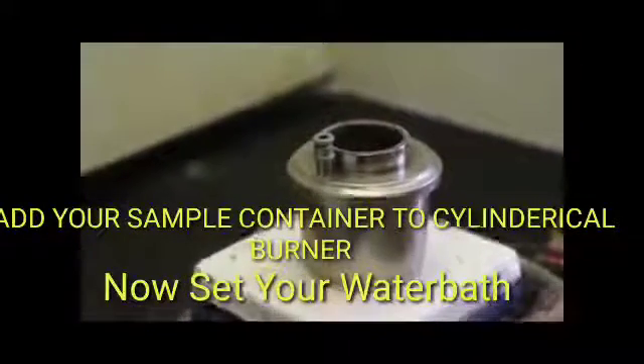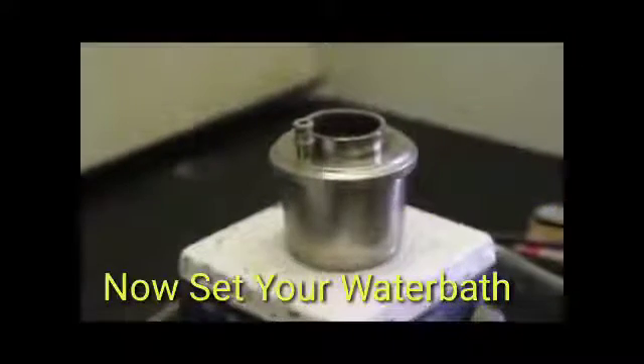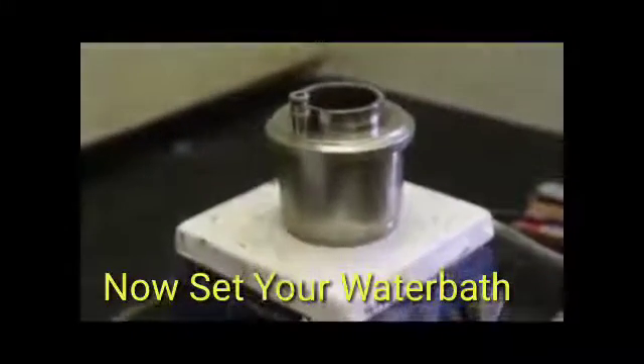All we do is we heat it, we heat this thing up. It's got a water bath that will just raise the temperature up a little bit, and then we record the flash point on it. And I didn't get to that point.